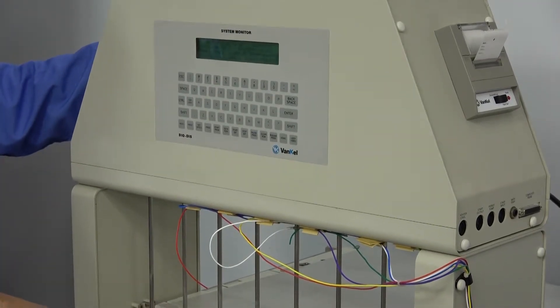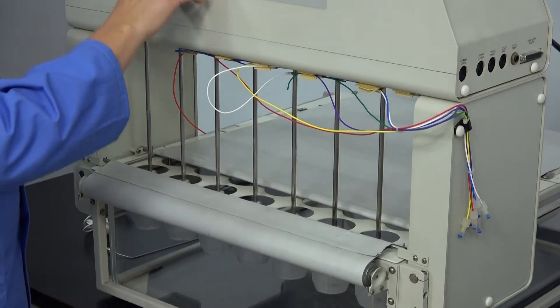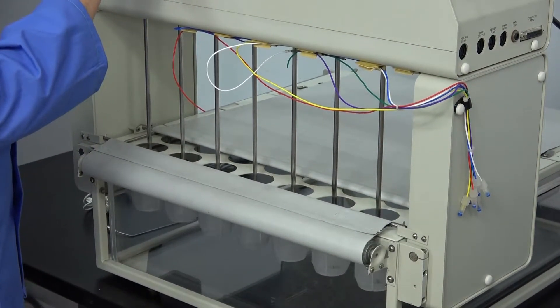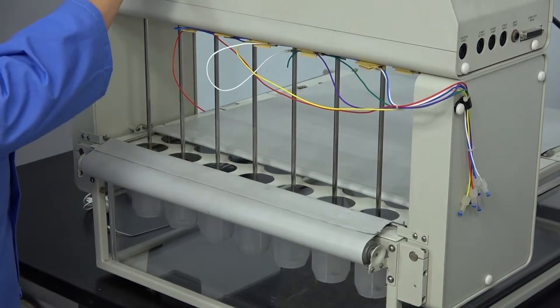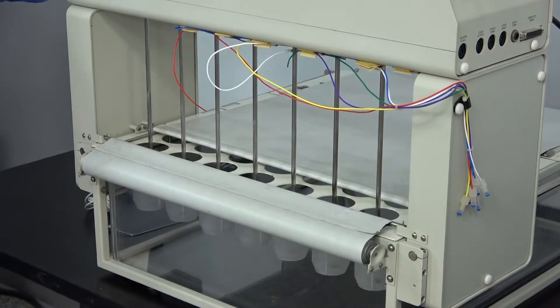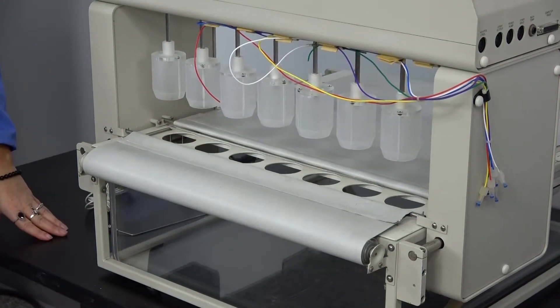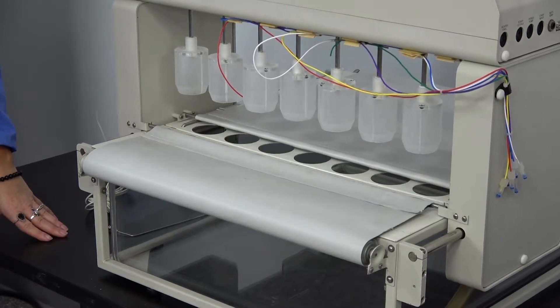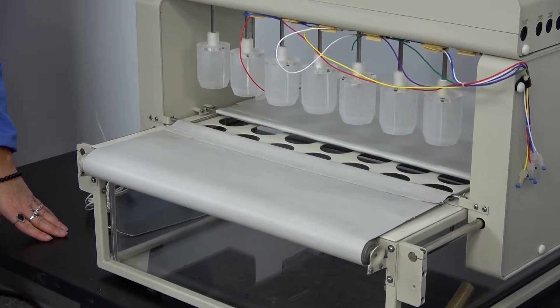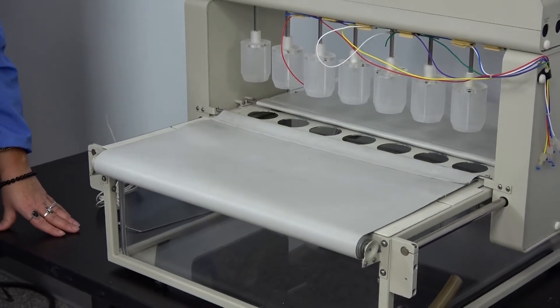We have it running on a cycle right now. We will go ahead and stop the cycle so you can see that the covers are also working on it.